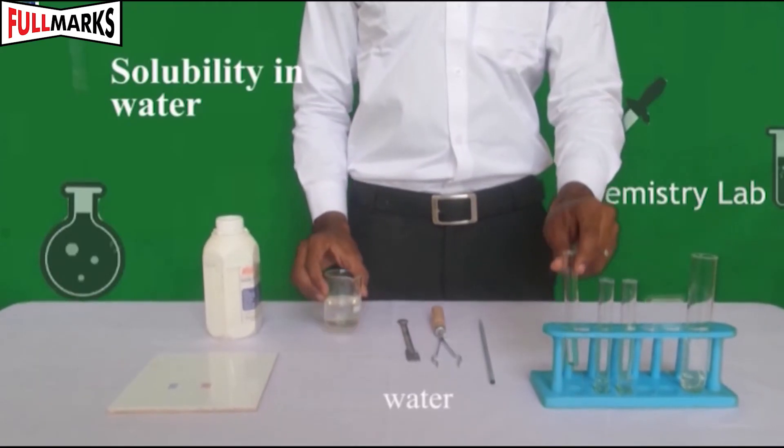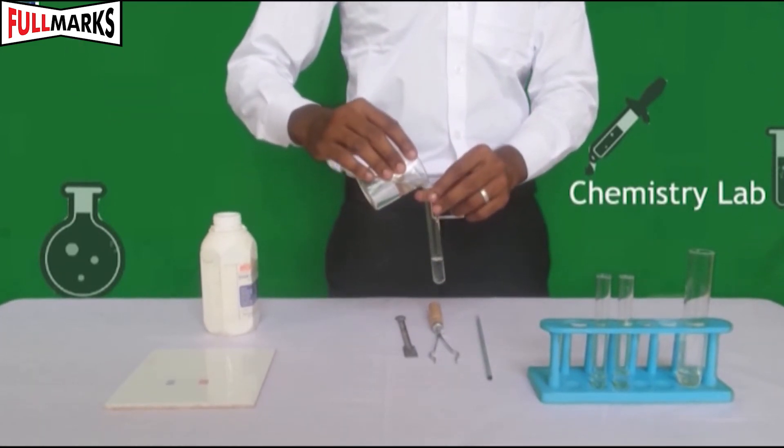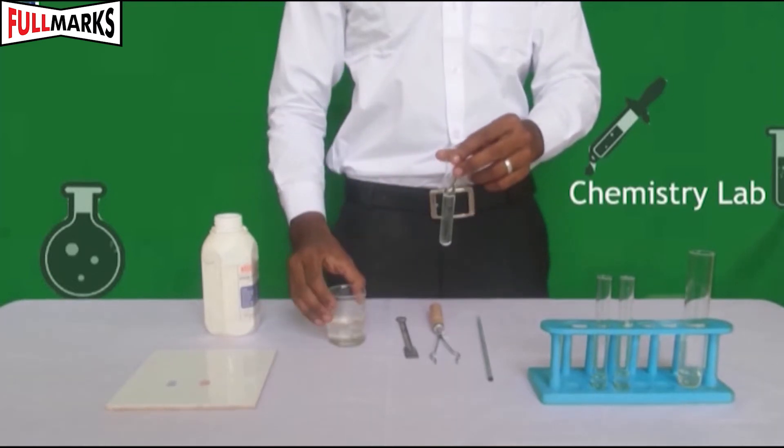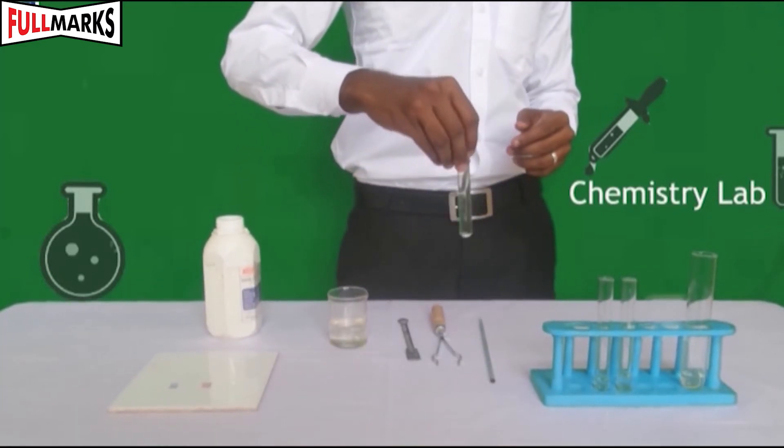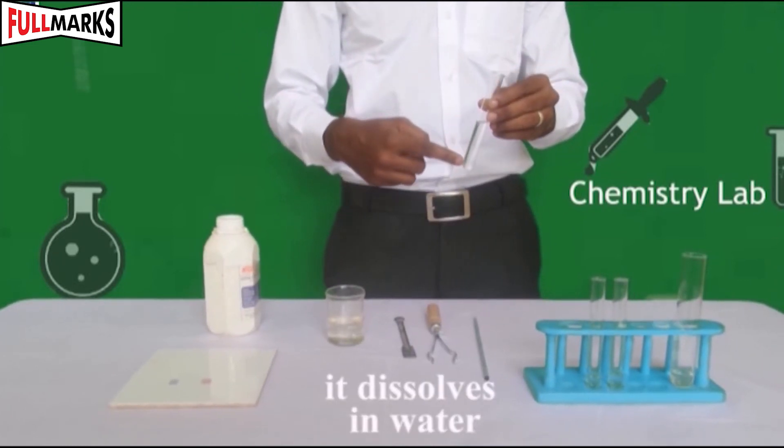Test 2: Solubility in water. Take 2 ml of acetic acid in a test tube, add 10-15 ml of water and shake. It dissolves in water to form homogeneous solution.